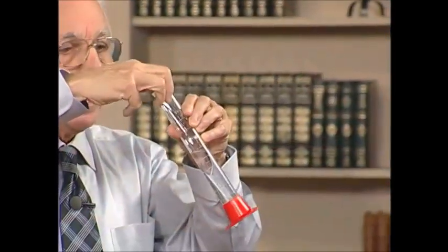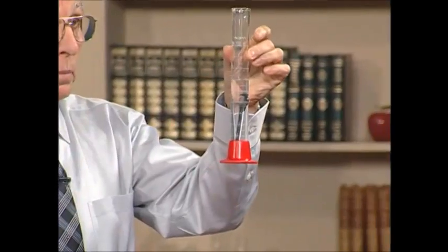It basically involves simply dropping the object into something like a graduated cylinder that already has some water in it, and observing by how much the volume of the water increases.